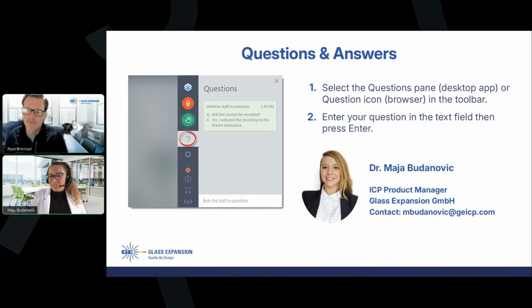Yeah, of course. I did not mention the temperature of the spray chamber, but temperature definitely does affect your results, especially if you have a huge fluctuation inside your lab. You can experience some fluctuation in your results. Again, it depends on how much room temperature difference you observe in your lab.